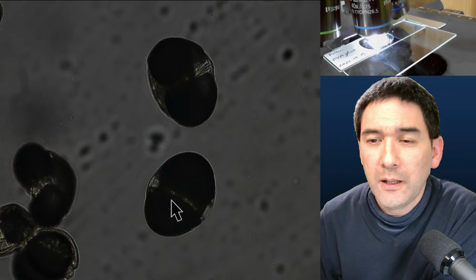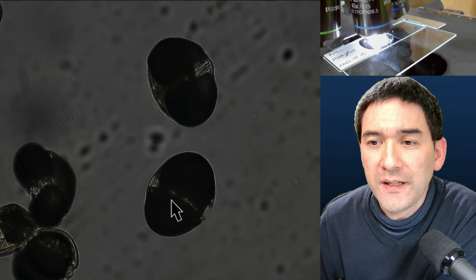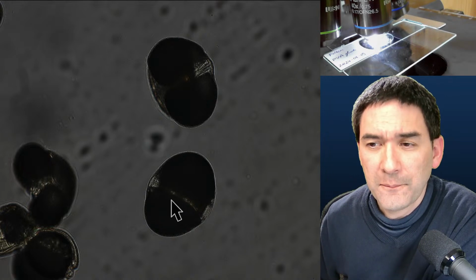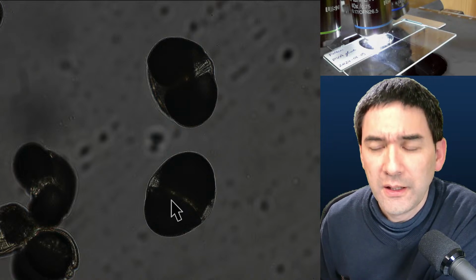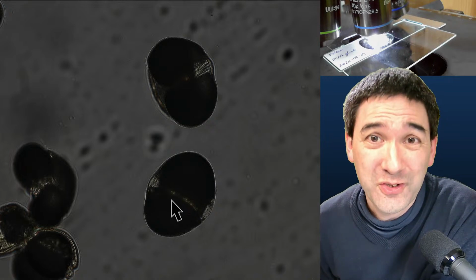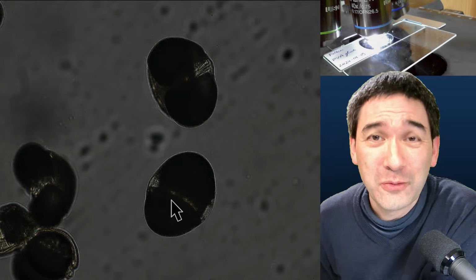Have you ever tried mineral oil as a mounting medium for things like crystals? And the answer is no, and the reason is that there was no need up to this point for that. If you use any liquid mounting medium which does not turn solid, then of course it's difficult to make a permanent slide.